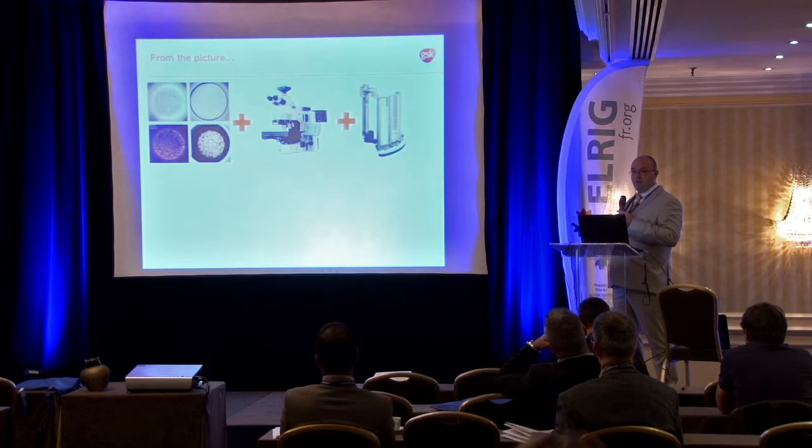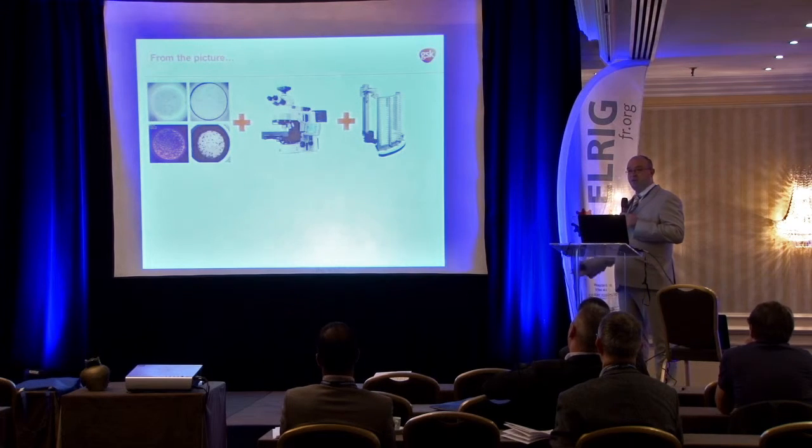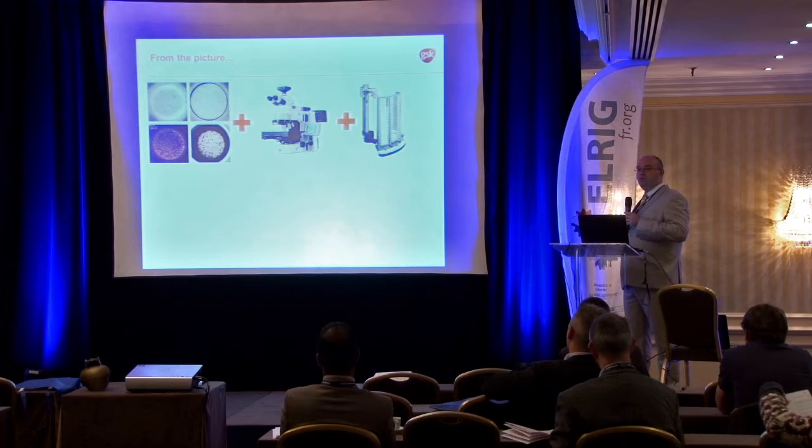And then, okay, now you are at the end of the project. The project is going further in the R&D process. You are now in the preclinical phase, for example, so you have a huge amount of samples to acquire. You need to robotize the loading of the acquisition device. Some issues could come.